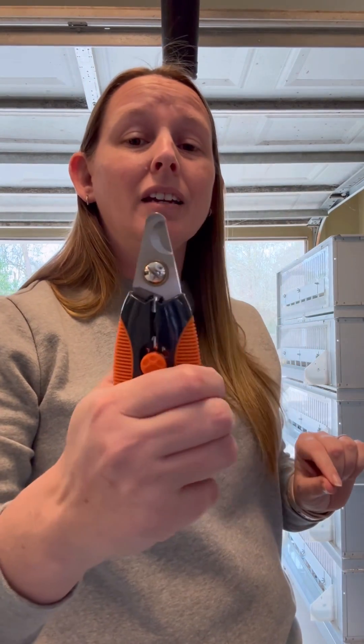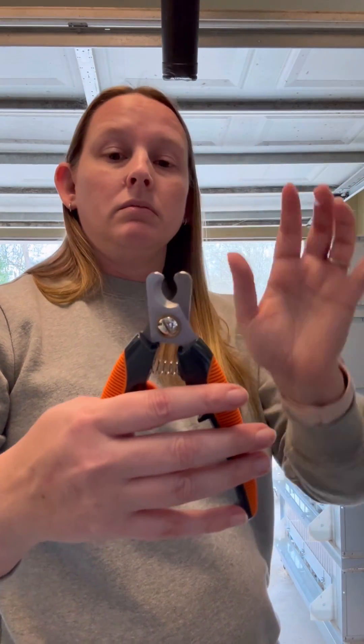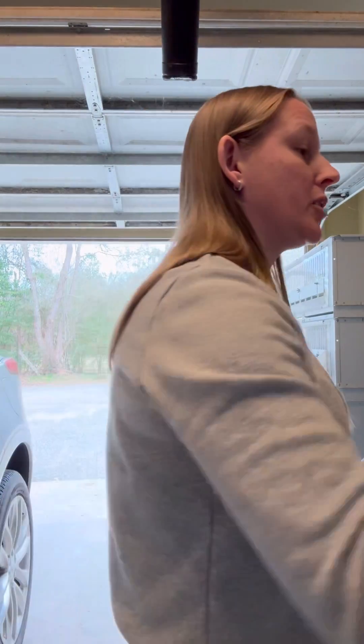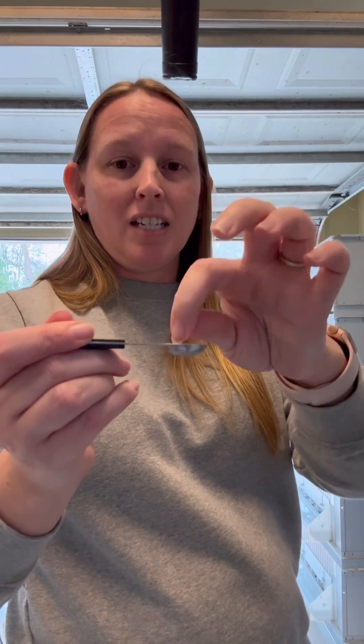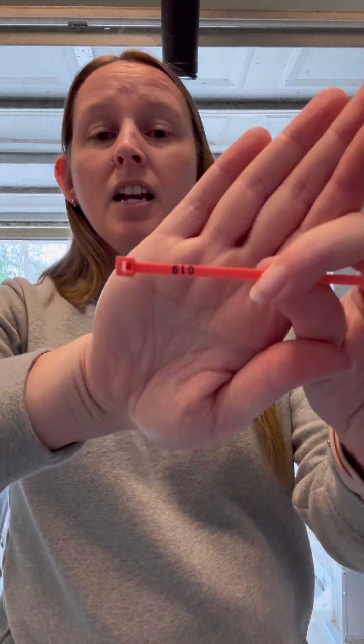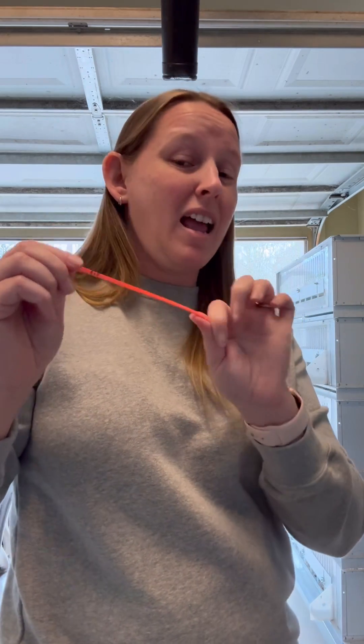You're also going to need clippers — I use dog pet grooming clippers, but you can use fingernail clippers. These seem much easier to clean in between. I also like to have some blood stop on hand; I got this at Tractor Supply — Walmart even has it, typically on the same shelf as the clippers. I like to have a little spoon to dip out a bit of the blood stop so I'm not making a mess with the big container. You're also going to need a way to label your chicks — I use little numbered zip ties, which you can get at Tractor Supply or Amazon.